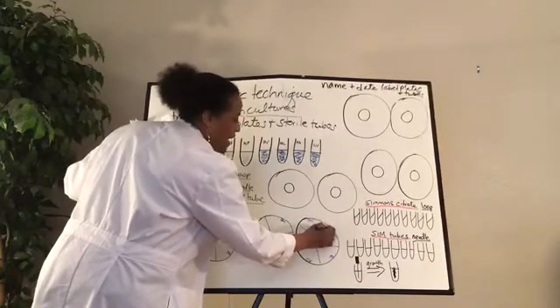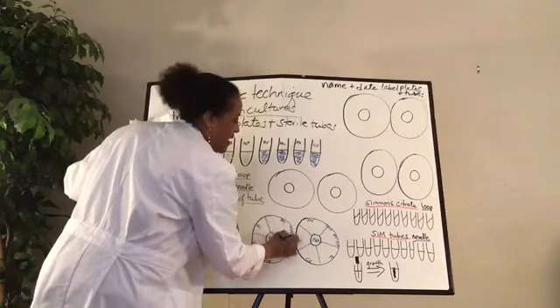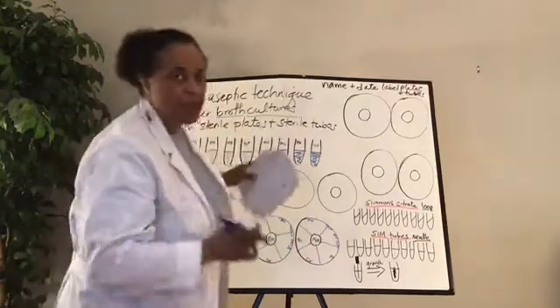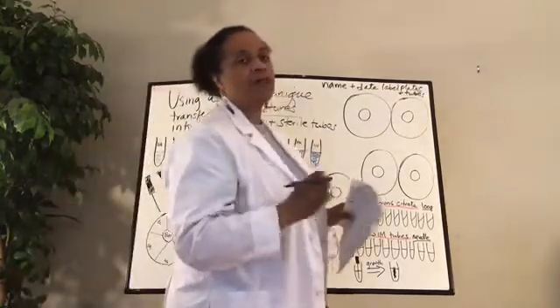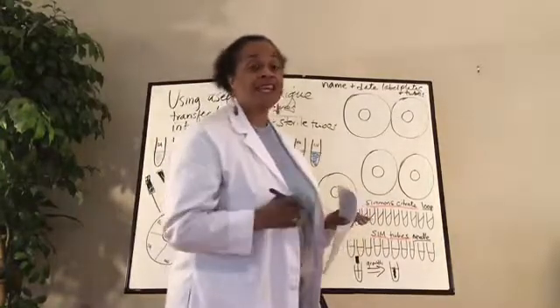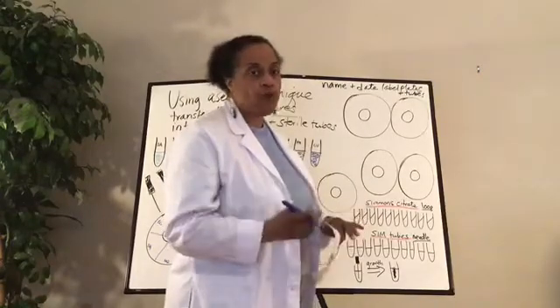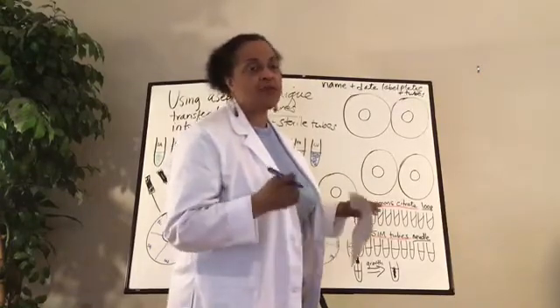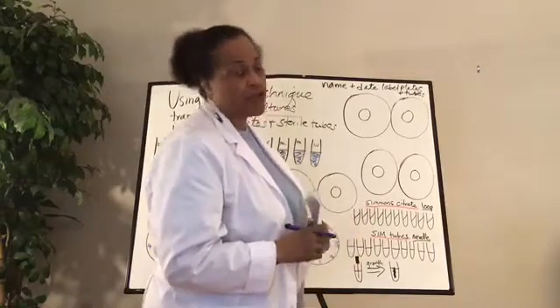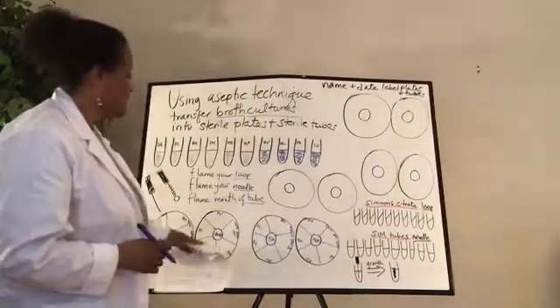Make sure your name and the date goes on each plate. I'm not going to stress that enough. I need to see that you do everything properly. Everything must be done properly. And if you don't know or you don't remember, look it up. No laziness on this paper. It's a formal report, and I'm going to be checking it because you got a lot more time to do this thing now. So I'm going to be checking it with a fine-tooth comb. So that's the MSA label.